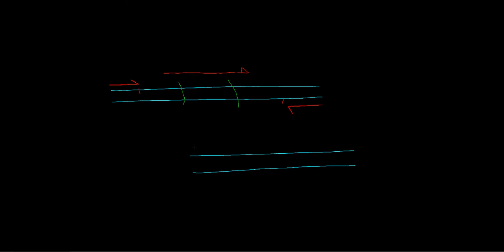That forward primer is going to give us our little green area. Again, I'm just bad with scale today. I'm going to step back even further. So that forward primer is going to give us our right-hand chunk.